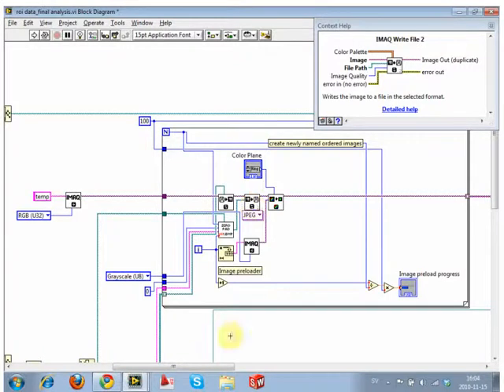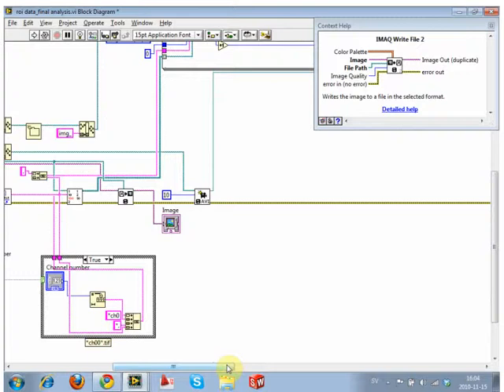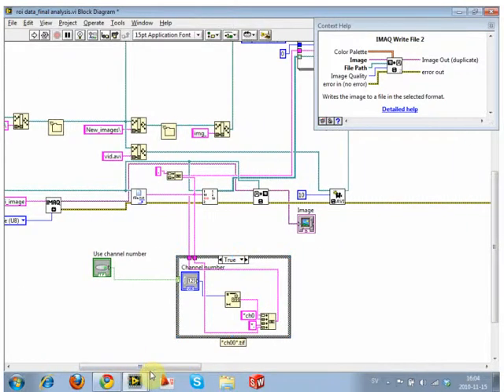Okay, well, you guys get this bit. This bit answers the question of how to handle the channel number, but still keep it so that we don't have to enter a filter. The filter name always gets iffy based on what characters you can use, etc. But if we know what data sets you're using, hard coding is probably good.